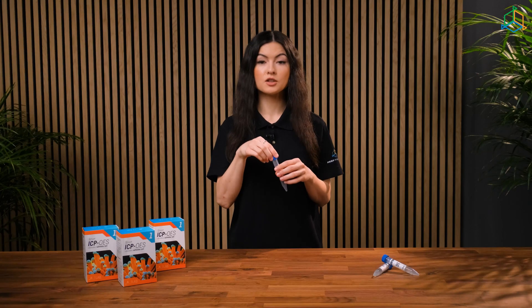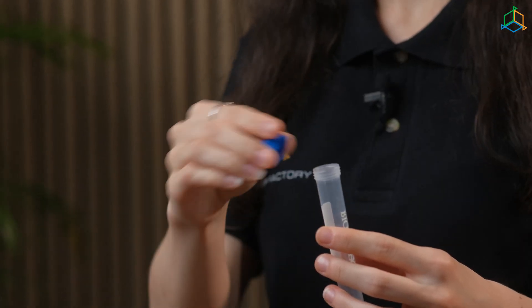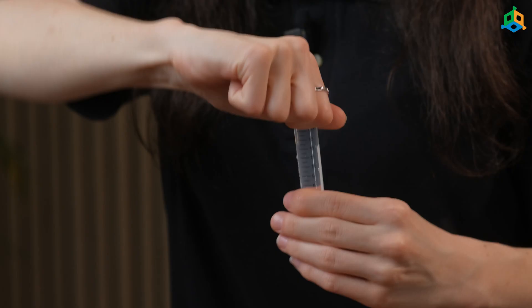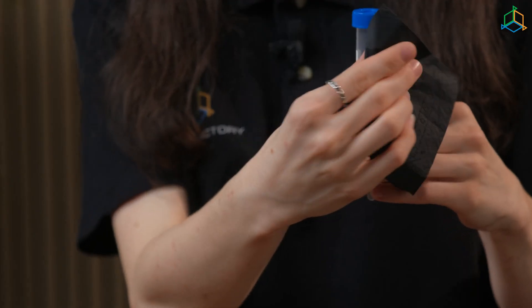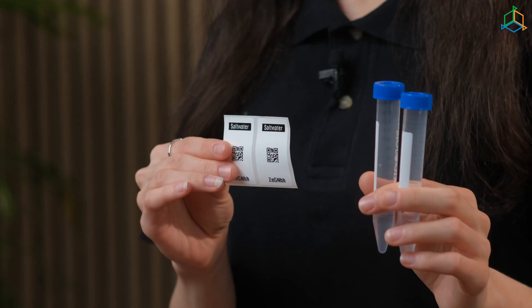In order to do this, unscrew the test tubes without touching the inside of the cap — remember. Rinse each test tube three times with aquarium water before filling it. Fill both test tubes with water and then close them tightly. Now dry both of these tubes with the included wipes, and then stick the QR code onto each one.